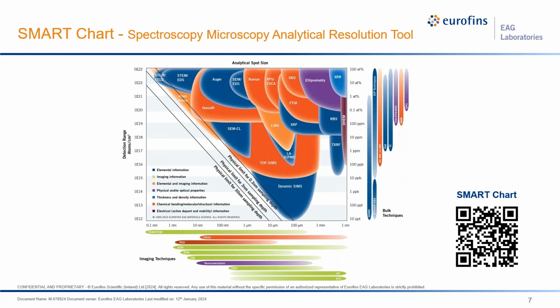Now, many of these techniques can do materials identification, and some of them can't. But we're going to talk about a few that can. And what we mean by materials identification is it's able to do an analysis and discover what's present. So you don't have to put in the elements you're looking for, you can discover what's there. That's really what materials identification means in our view. And that's how we're going to concentrate our talk to the techniques that can discover what is there and give you that identification.